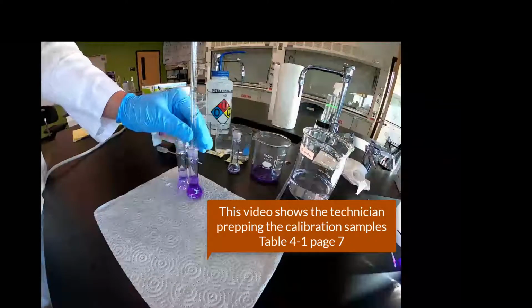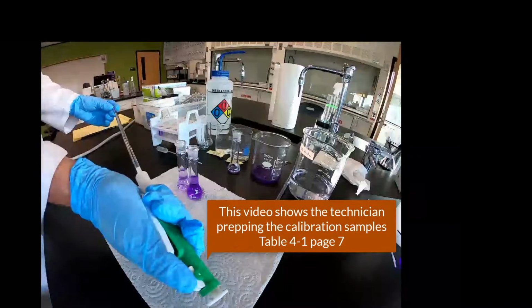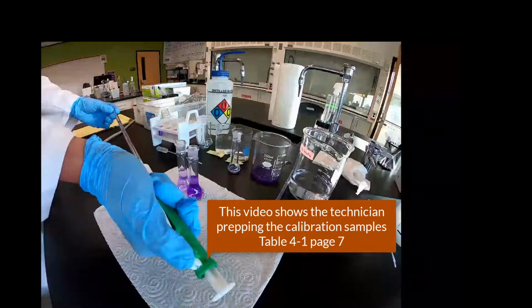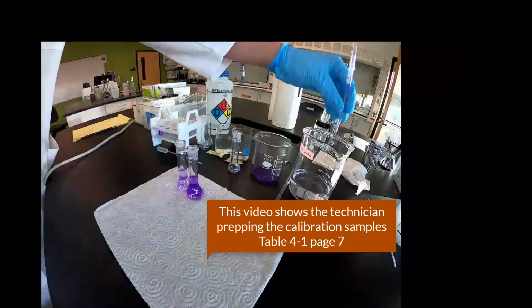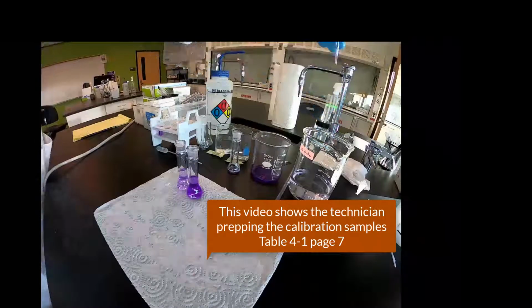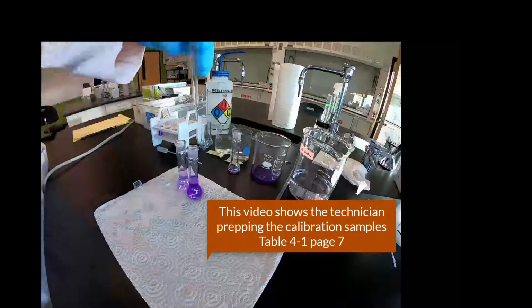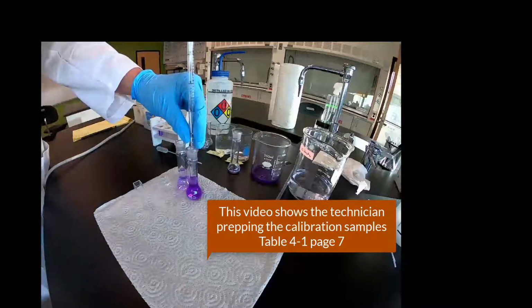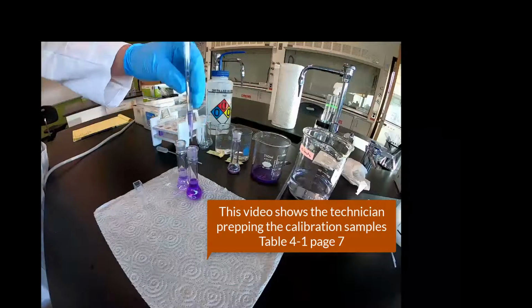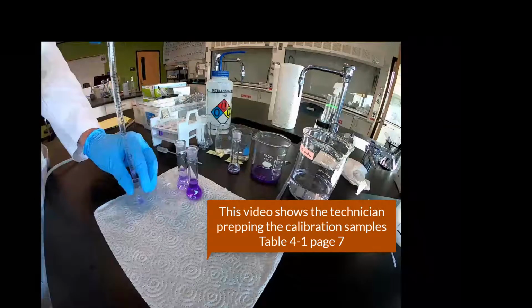What are we doing here? We're going to take the... I think what he's doing is prepping that so he can dispense it into the cuvette, which he is. And for cost efficiency, we don't need to use that volumetric. Just use those little throwaway pipettes. You can just reach in there, give them a quick rinse, and then fill that cuvette, and it just needs to be above the shoulder.